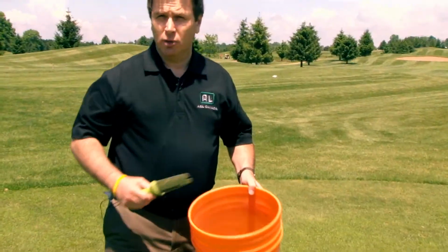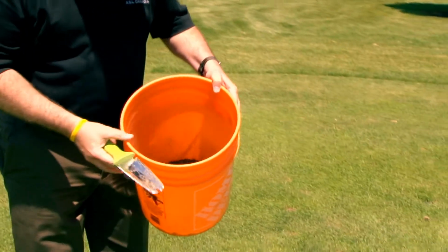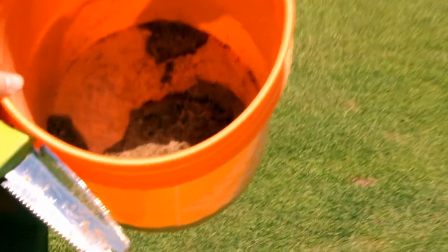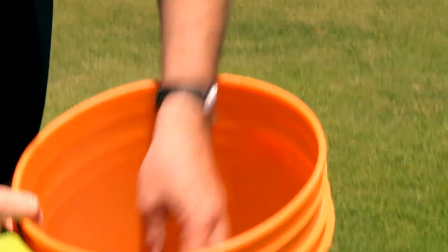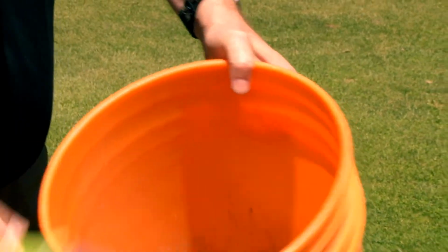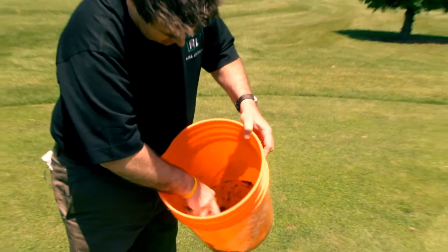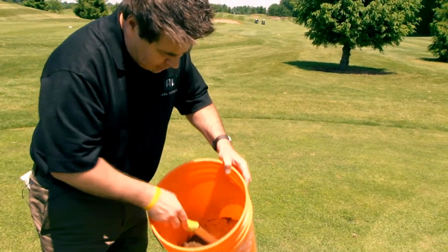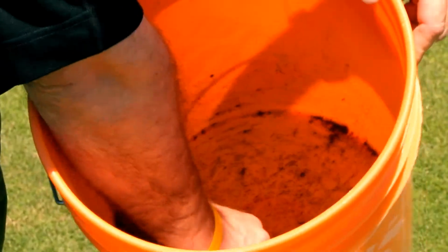Once we've collected our 20 or more cores from the sample area, we want to make sure that we've got them mixed up into a nice homogeneous sample. We don't want to have any of these cores left intact like that. So you can just take a good garden trowel and mix it up. Sometimes you may need to use your hand just to break up those clods a little bit.